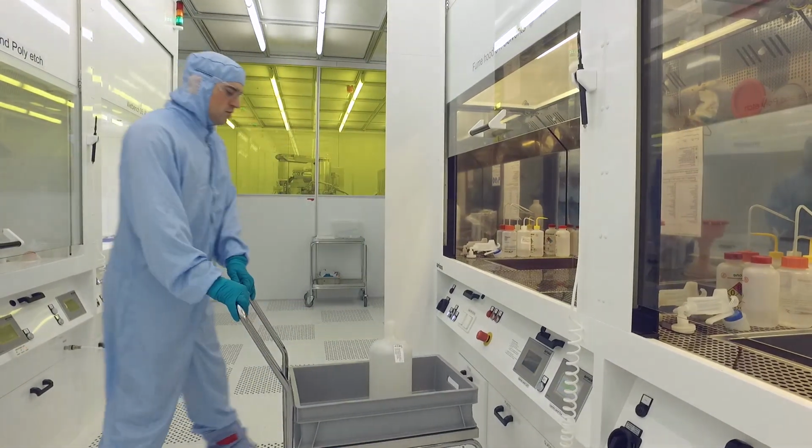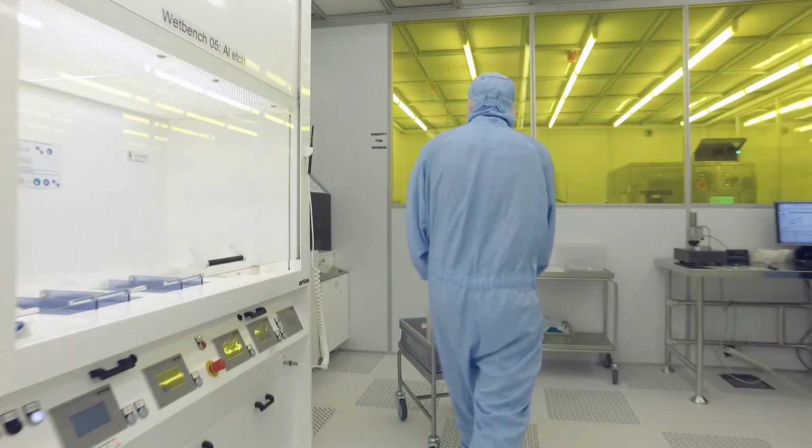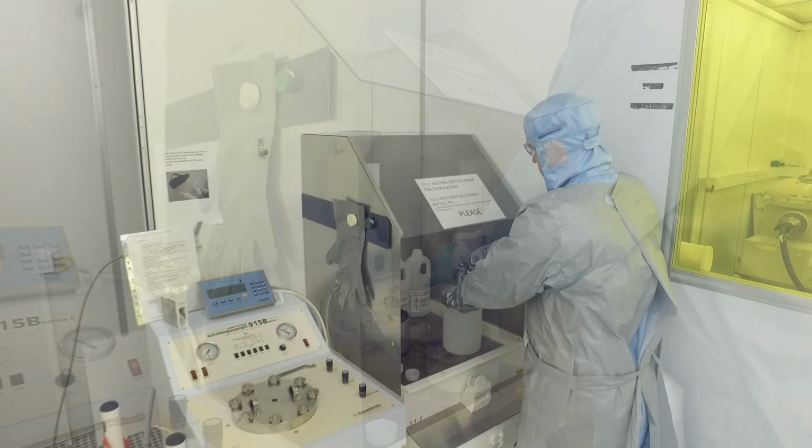If your chemical is neither C waste nor a common acid or base, it should be collected in a suitable bottle with a cap and proper safety labeling. Talk to Nanolab for details.